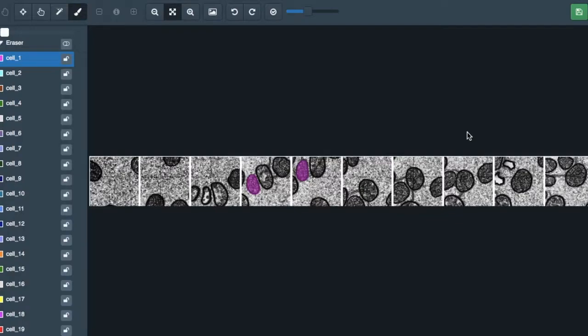If two cells are pressed into each other, like here, it is extremely important to label the cells with different colors to show that they are, in fact, two separate cells. Finally, we have adjusted the contrast on these images to make the cells clearer. However, this occasionally results in artifacts. Remember that cells are oval or bean-shaped, so any dark regions or cell-like objects, like here or here, are artifacts and should be ignored. After you have accurately colored all cells in an image, you're ready to submit.